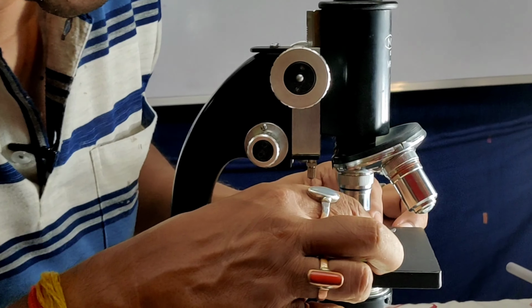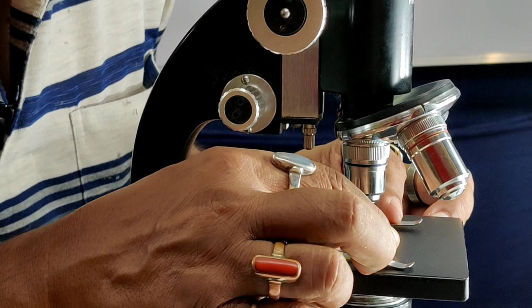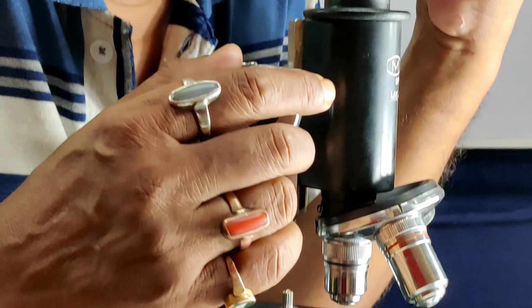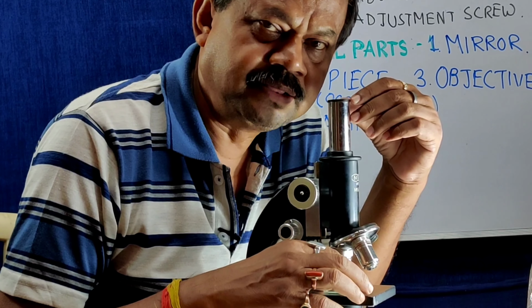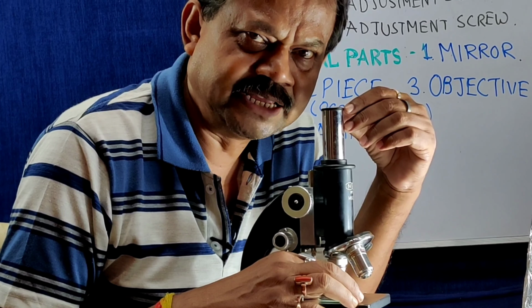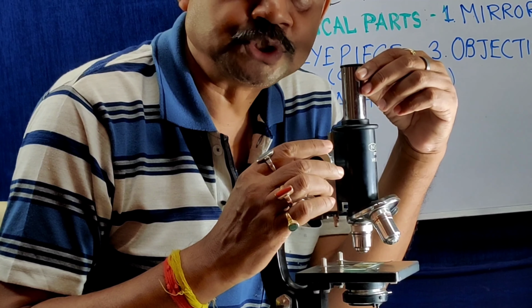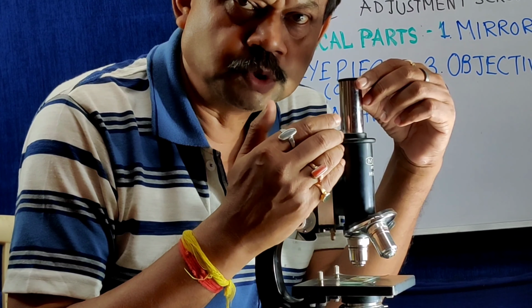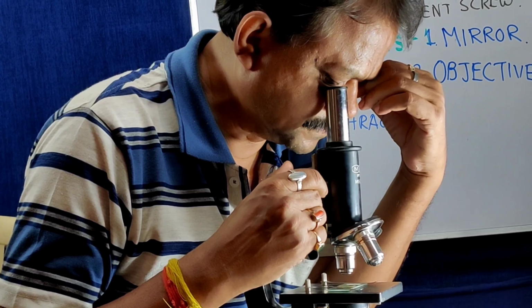Now we fix the portion in the middle of the aperture of the stage and see it through the ocular lens. After keeping the slide on the stage, we rotate the coarse adjustment screw so that the body tube comes down and the specimen comes into focus.